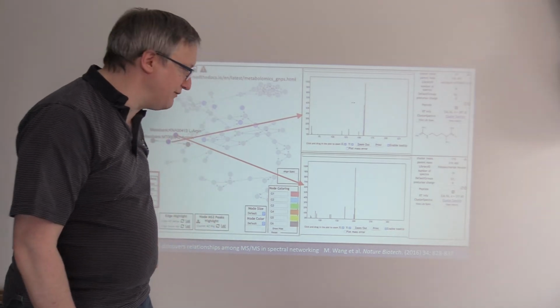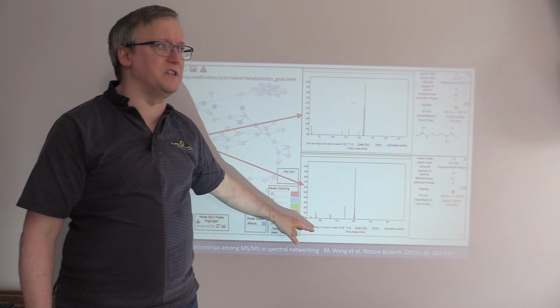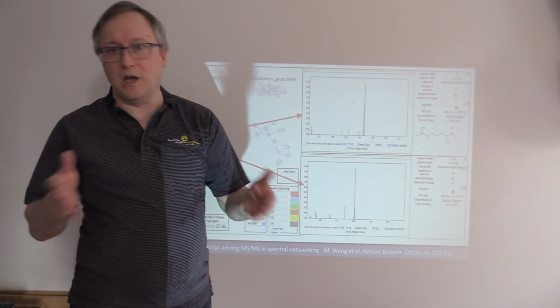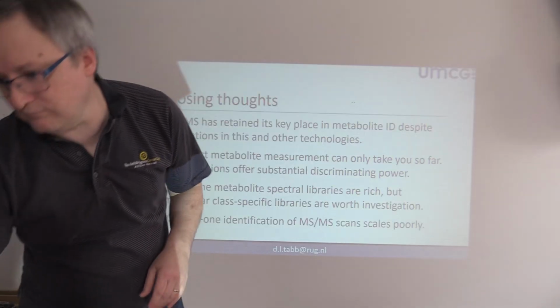Okay, and you can find more information about that in Ming's paper from 2016. He now runs the GNPS 2 service over at UC Riverside. So both UCSD and Riverside have software of this type set up.